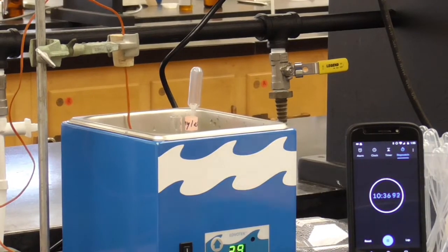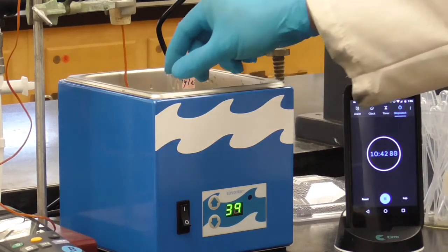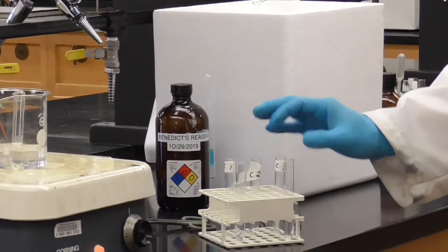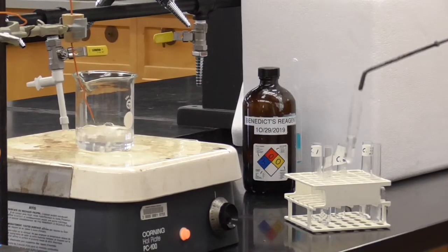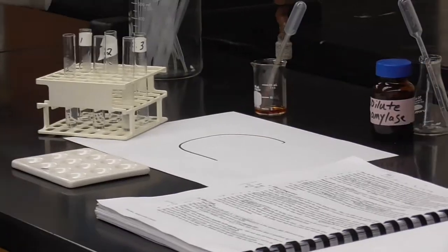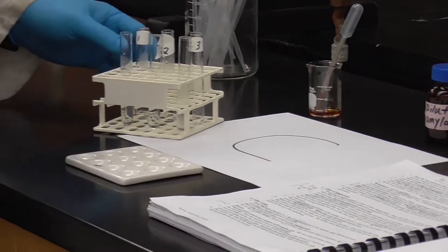Okay, so the enzymes have had 10 minutes and 30 seconds or so to react. Let's test them. Here it is, the 37-degree one. Put that in the first spot in the test rack. The cold one over here. That was number 3, and then the one at 100 degrees. There. Okay. Let's go over here to our test plate.